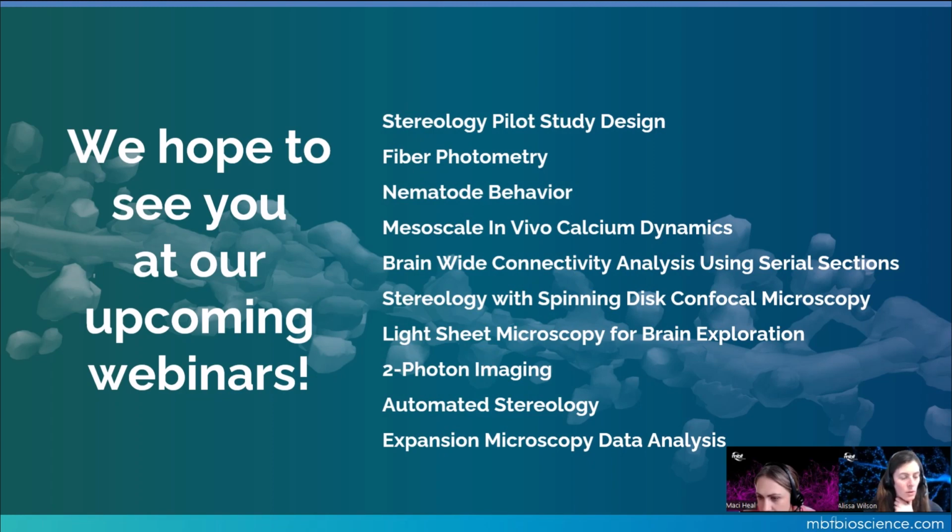And then are all the question about new tools and options available on the older versions of Neurolucida, and some of the things that we went over today are available there, but anything that is newer is only available in our newer software. So happy to, yeah, please contact us and we can get you upgraded. Yep.